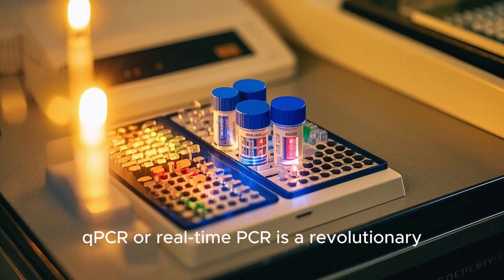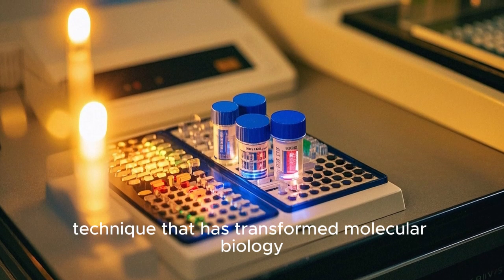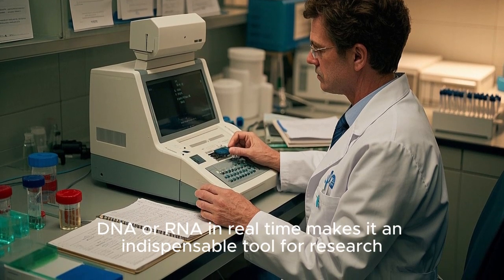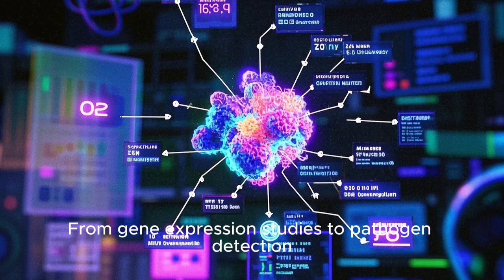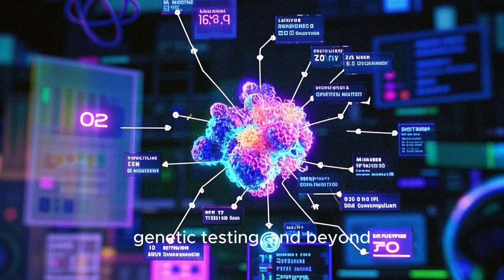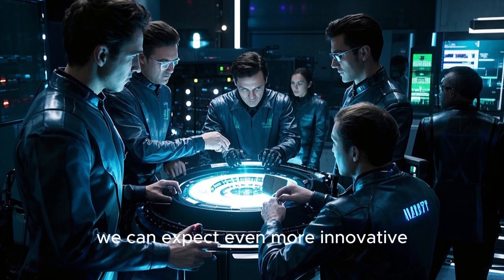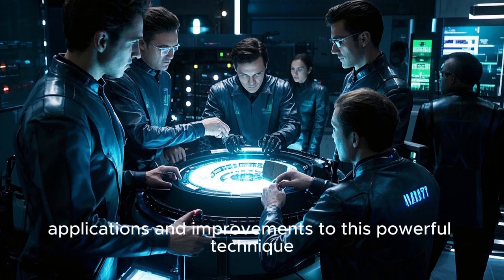In conclusion, qPCR, or real-time PCR, is a revolutionary technique that has transformed molecular biology. Its ability to amplify and quantify DNA or RNA in real time makes it an indispensable tool for research, medicine, and industry. From gene expression studies to pathogen detection, genetic testing, and beyond, qPCR continues to drive groundbreaking discoveries and advancements. As technology evolves, we can expect even more innovative applications and improvements to this powerful technique.